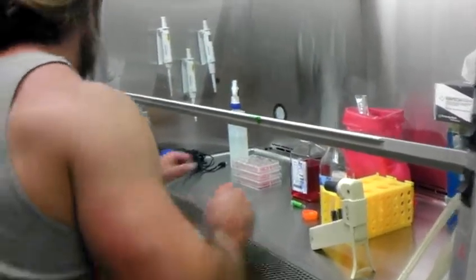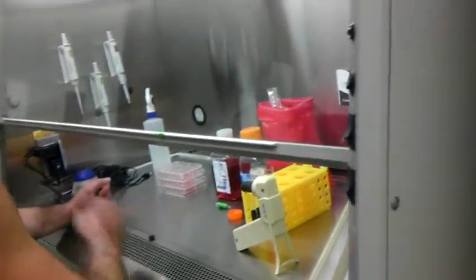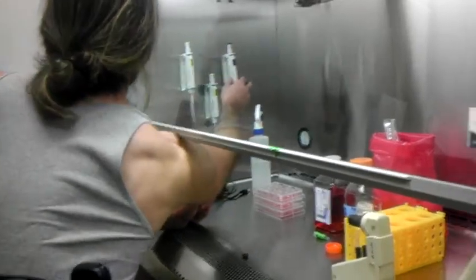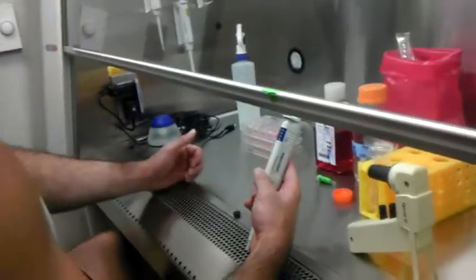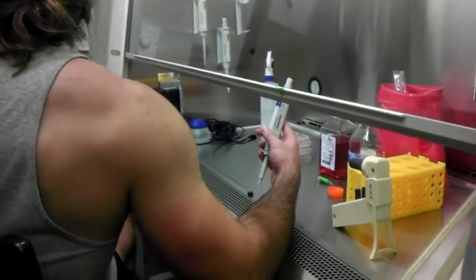Oh, okay. When you wash the cells with PBS, you can use one of those. But I typically don't even wash the cells with that. When I'm doing the experiment, I only use the 1,000 microliter pipette. You want to be super accurate when you do this. And when you spray the sides of the wells, the automated pipetter does it really hard, so I use that and I can control it a lot easier.